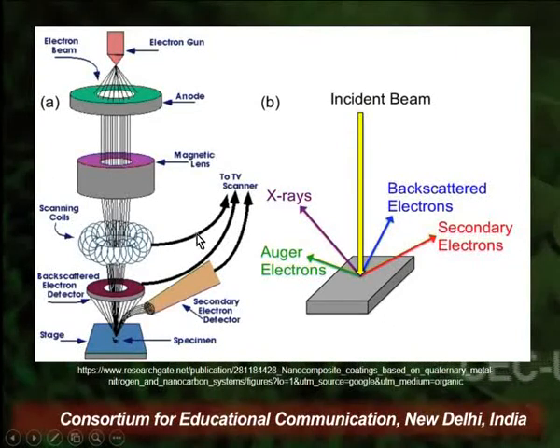So there is a direct comparison between non-deflected or the primary electron beams and the secondary electrons, and this creates a computer generated image so that the minute or the finer details of the sample topography could be observed.